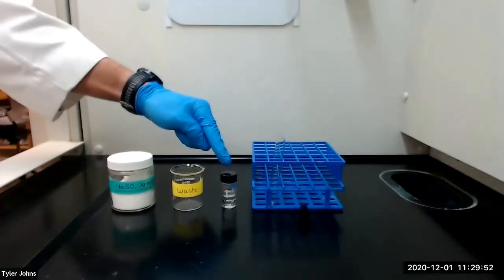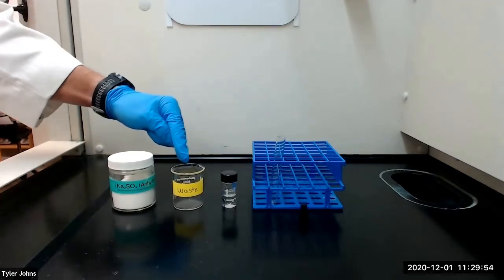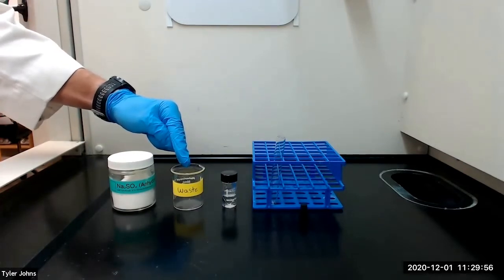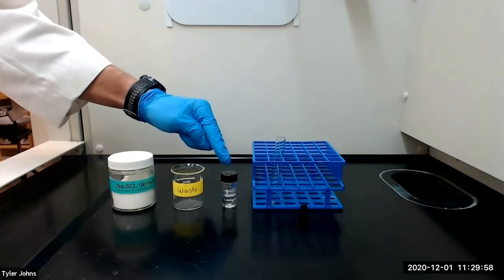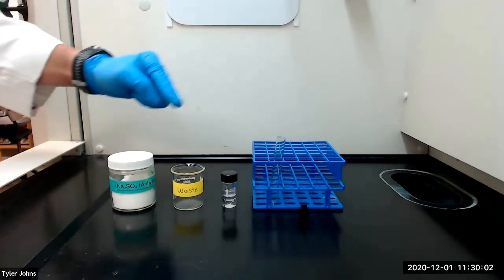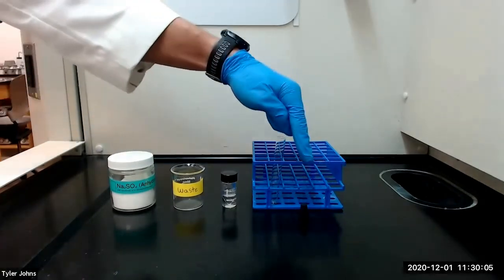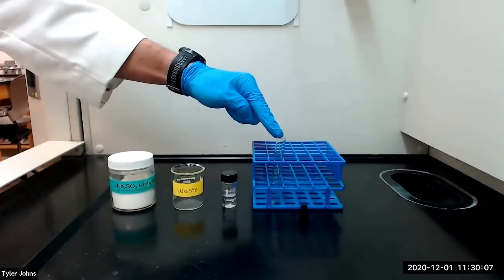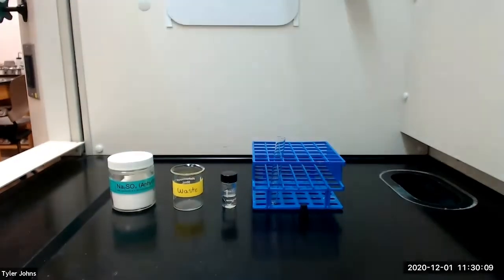After the layers have separated, we will remove and discard the bottom aqueous layer and then transfer the remaining organic layer to a small test tube. We will then dry the organic layer over anhydrous sodium sulfate. We will stopper the test tube and allow the organic layer to dry for 15 minutes.